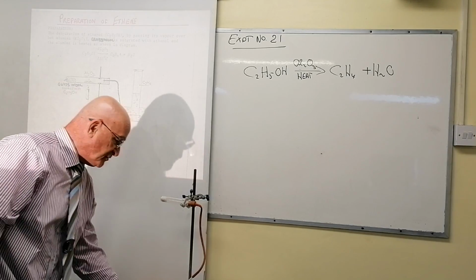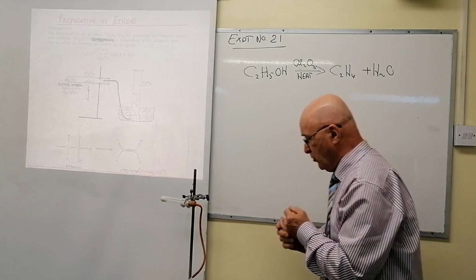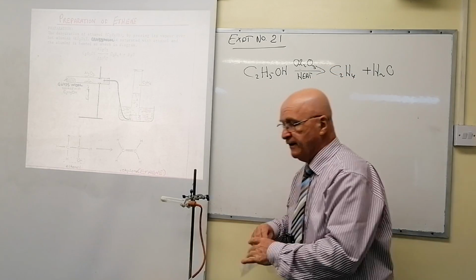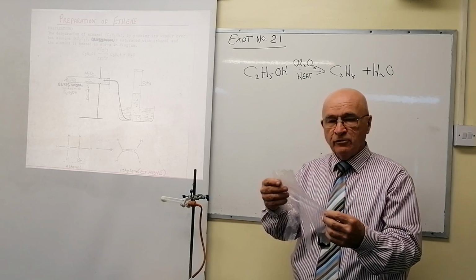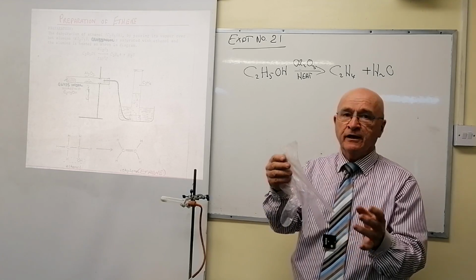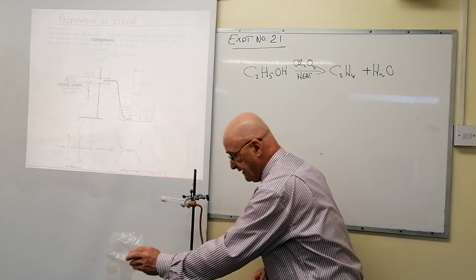Now, the sequence in which you do the things is very important. Even though I'm not doing it for you here, I need you to know as well what I'm doing. Let me just show you a few things. I have rubber gloves here. At this particular time in our careers, rubber gloves have a second meaning, haven't they? But I have to use a protective glove here. You're not supposed to handle some of these chemicals. I'm mentioning that to you, right?